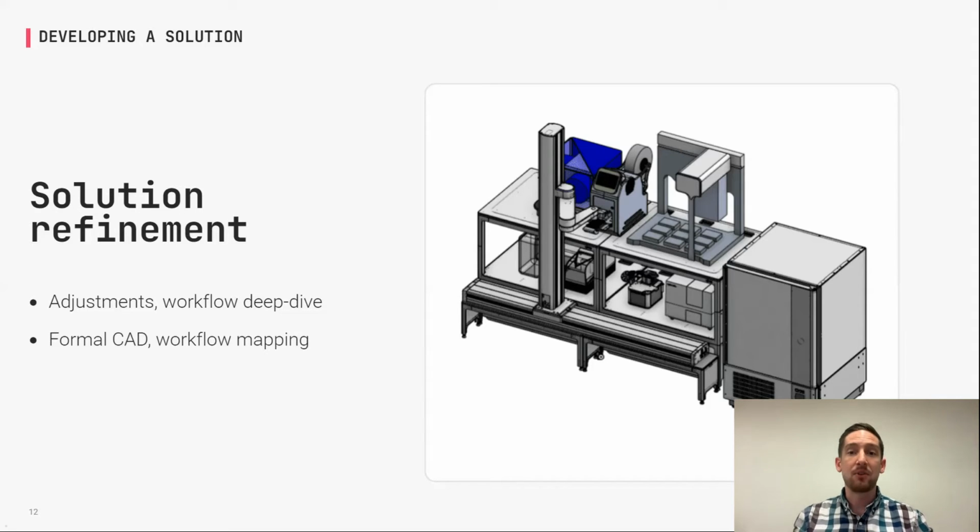And then I put together a workflow through Figma, but any sort of Visio or Miro project mapping type software, to really make sure that we understand every step from beginning to end.